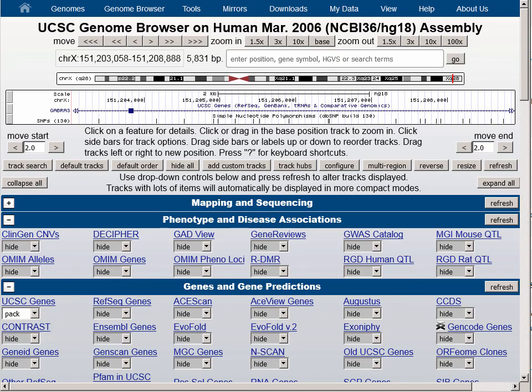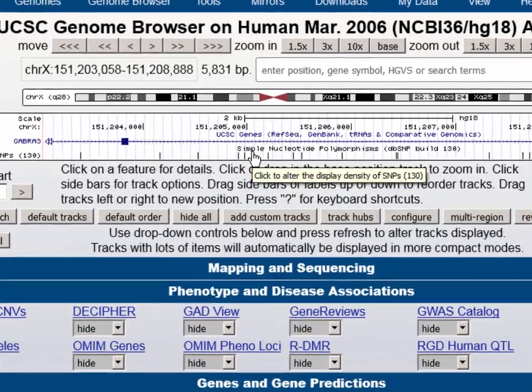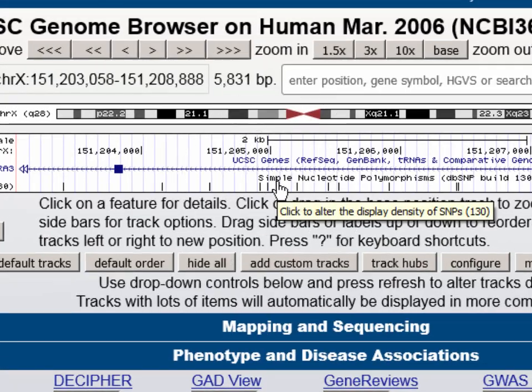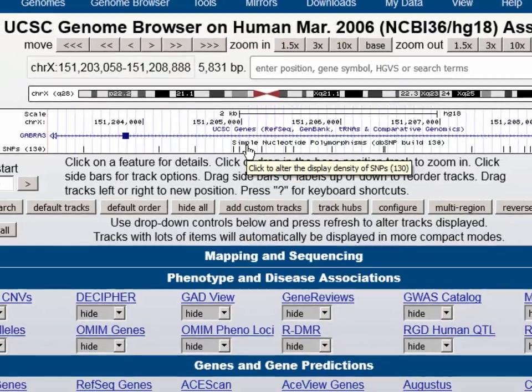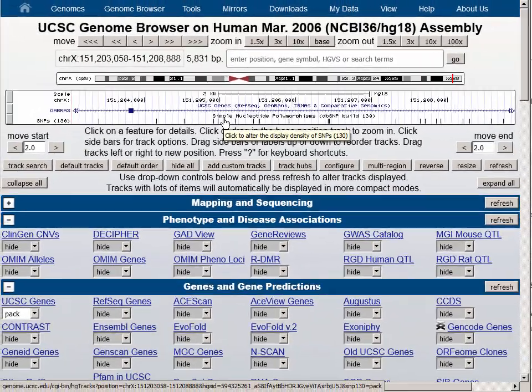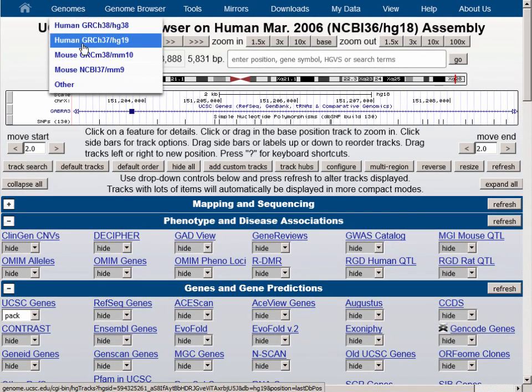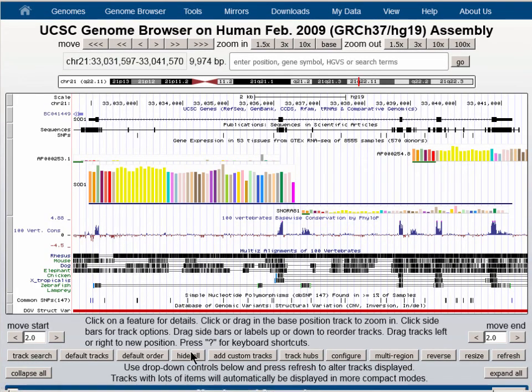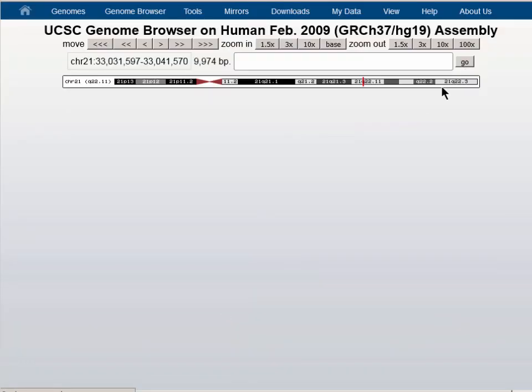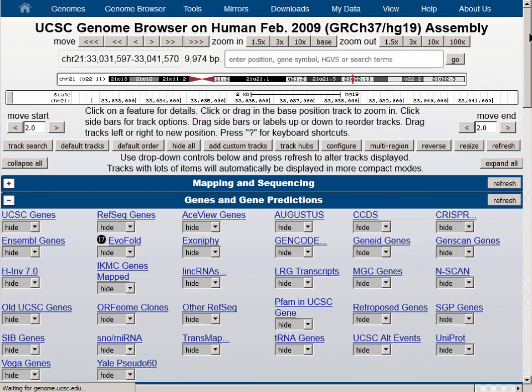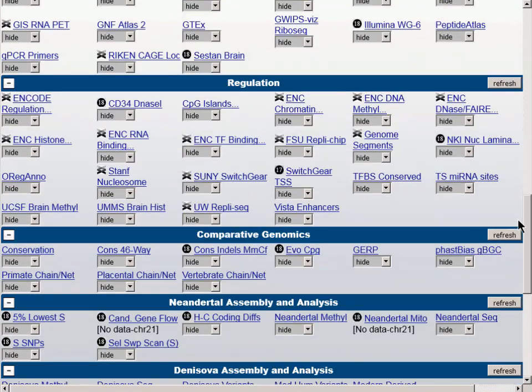You'll also notice something else about the nomenclature. The genome browser uses the word 'simple' instead of 'single' in the acronym for SNP, primarily because NCBI had been using it that way. Some of the variants in the database are larger than a single nucleotide. So let's navigate to the HG19 assembly, the next most recent version of the genome, and we will hide all the tracks again. Scrolling down the page on this assembly, you see that we have separated the variation from the repeat section.